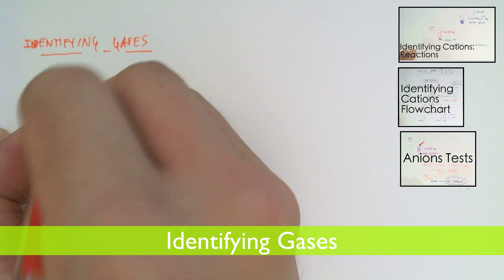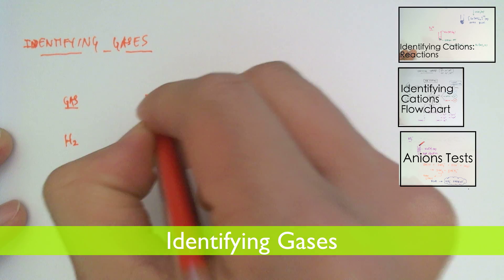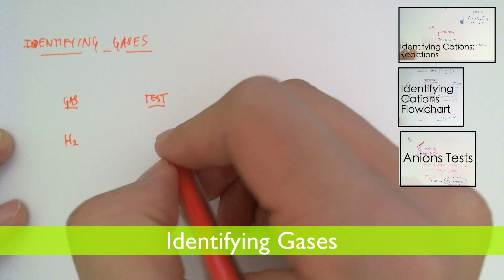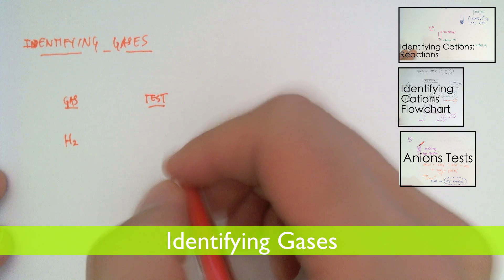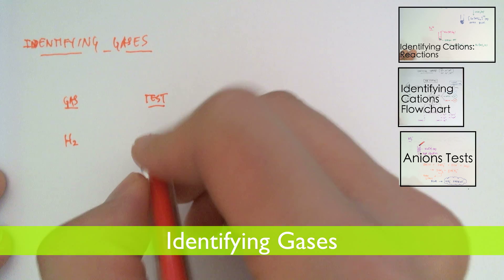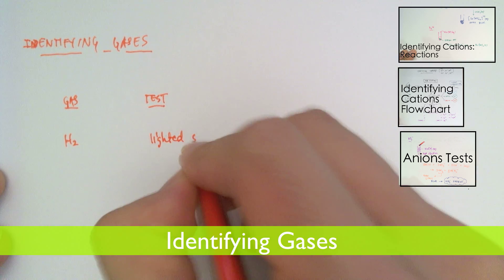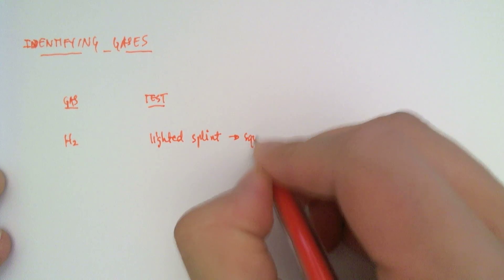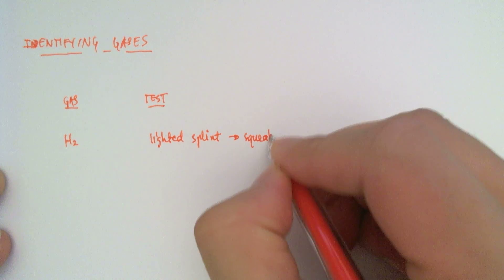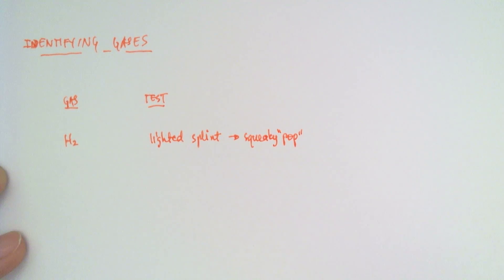Let's first take a look at hydrogen. The test for hydrogen is to use a lighted splint. Hydrogen is highly combustible in oxygen. It reacts violently with oxygen to form water. So we'll take a lighted splint and that will give us a squeaky pop sound if we put it to the top of the test tube.